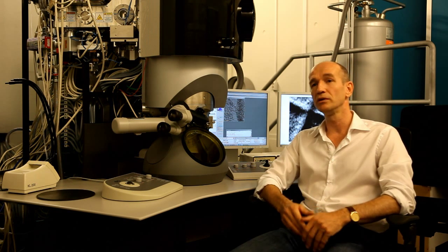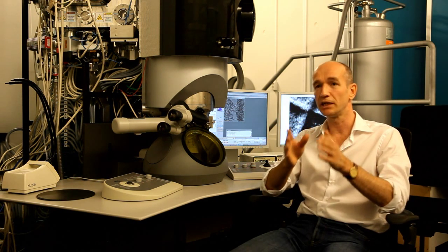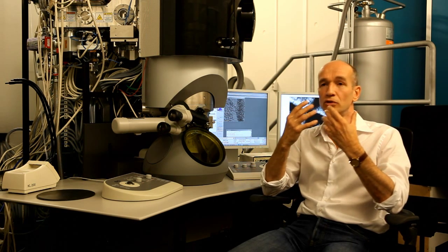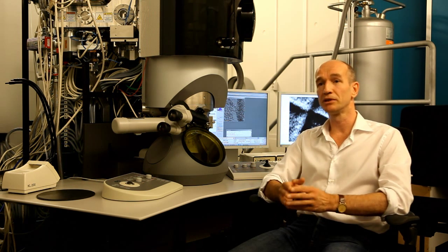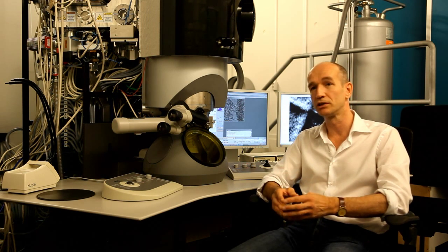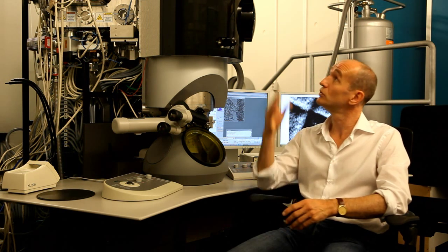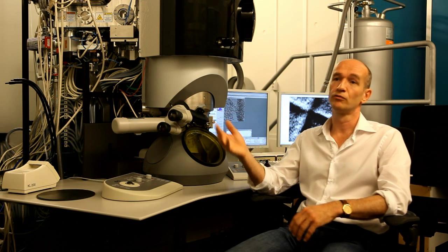If we look at bone and teeth and shells, we see that nature can make very precise materials with shapes and properties that are designed precisely for their function. By trying to do this in the laboratory, we are now finding ways that we can make materials in the same way, with the same precision, both in shape and in the properties, so that we can make new materials. For example, for bone implants and for biomedical imaging. And we're using this microscope to do electron microscopy at high resolution for these studies.